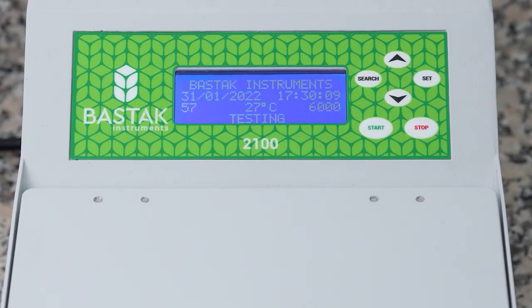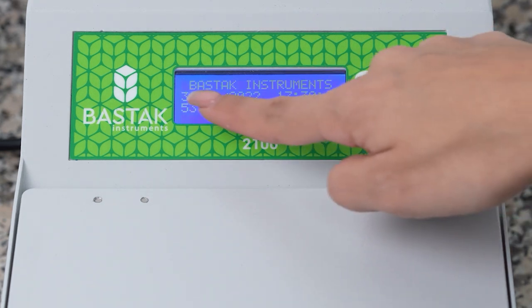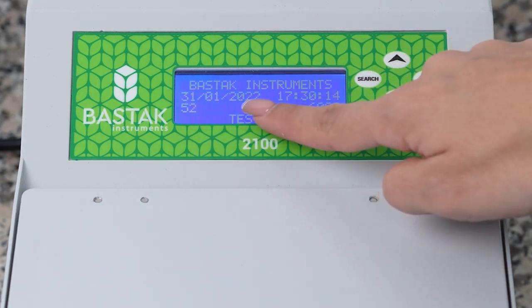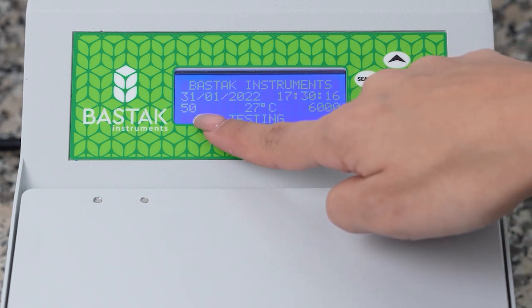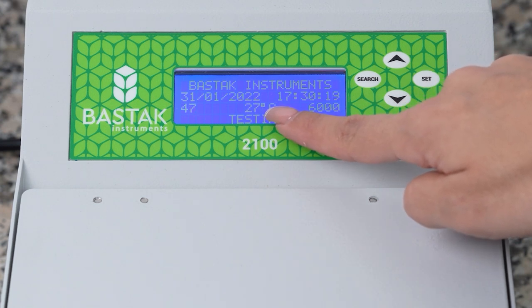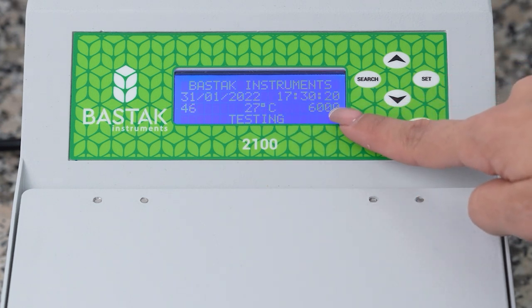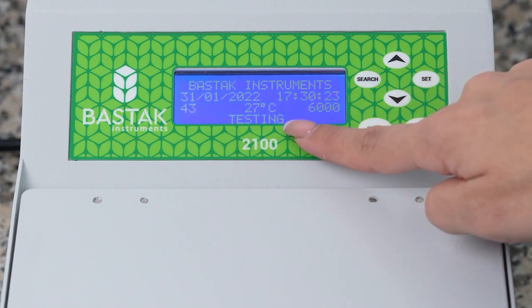While the device is operating, you can see the company information on the top line of the LCD screen, the date on the below left, the time on the right side, the remaining time from the 60-second total operating time on the below left side, the ambient test temperature in the middle right, the 6000 revolutions per minute actual operating speed, and the stages of the test on the bottom line of the screen.